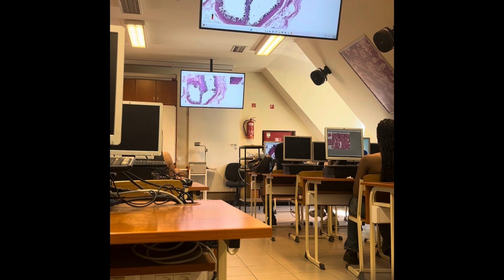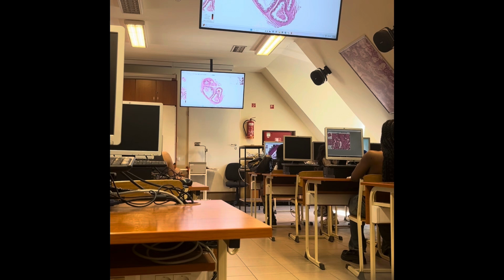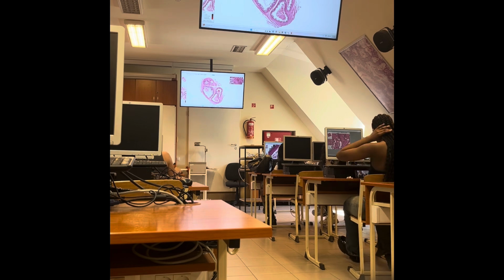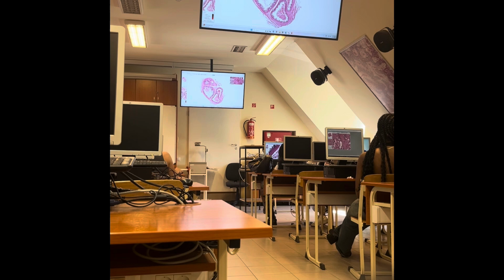Okay, so then let's see the other version of this specimen. This is the one, and this is a segment which shows where the seminal vesicle is close to the ductus deferens. Yes? You talked about the ganglia and the mucosa. Yes, I showed you the ganglia. But then you started to talk about the cells around. Yes, because there was a question here about the secretory mechanism. So you can go back and talk about it again? Yes, this is what I wanted to tell about the ganglion.